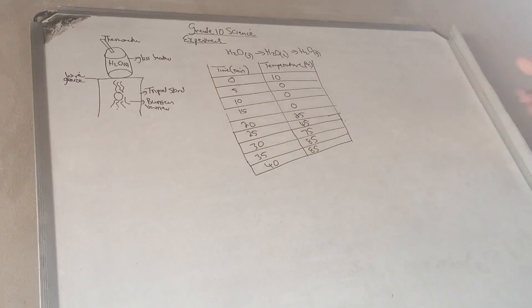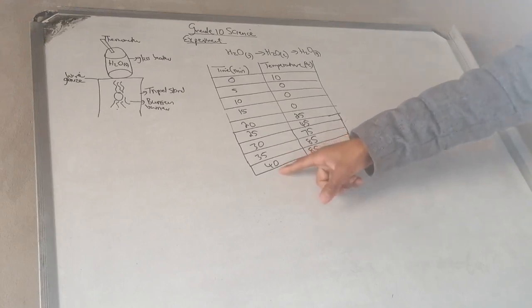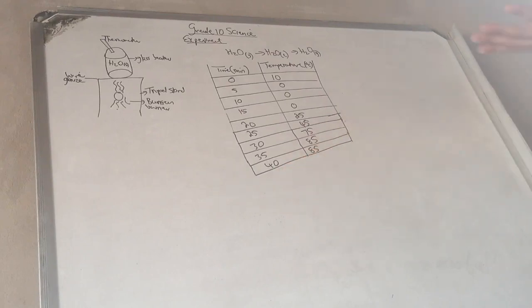And water has not yet boiled here, because water boils at 100 degrees. So by just looking at the data that is provided, we have a problem with this, because the statement said, continue stirring and measuring the temperature until the water has boiled for 3 minutes. So water boils at 100 degrees, and you allow that water to boil for 3 minutes, to see whether the temperature will rise above 100 or remain constant for the first 3 minutes after it has reached 100. So we haven't even reached 100 here, and you are already 40 minutes into conducting the experiment.